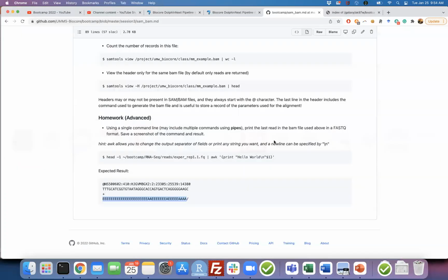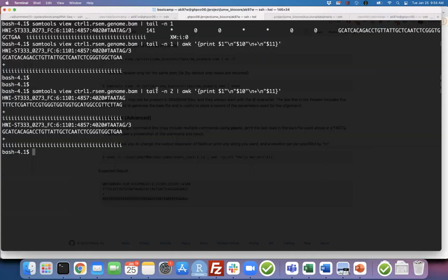So we do these kinds of things a lot, like converting some BAM files to BED files, BAM files to FASTQ files, and FASTQ to align them again. For example, you may want to get only reads mapped to some specific region. So you have some tools for that.